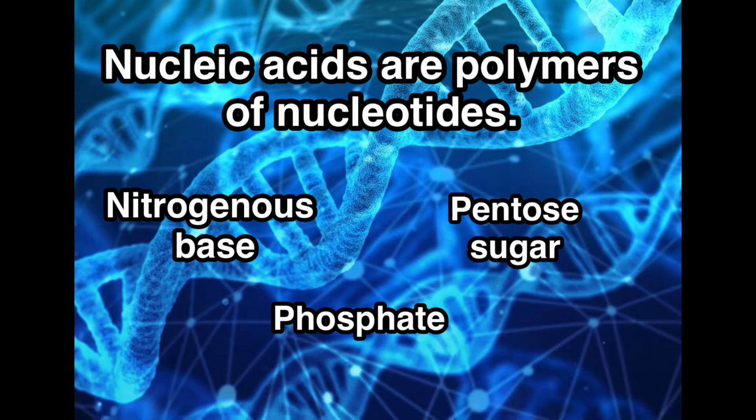But before conducting these chemical tests, it is very necessary that the RNA should undergo hydrolysis first. Hydrolysis would break down the nucleic acid into free nucleotides and the nucleotides into their free components.